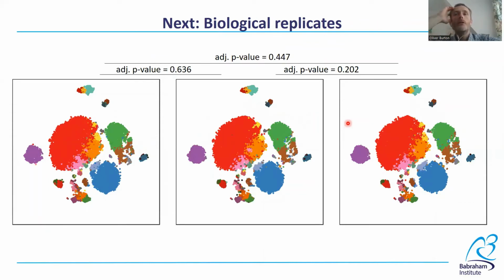In mouse research, we generally use inbred mice to eliminate variation. In this case, I'm showing you 3 t-SNE plots, 1, 2, 3, taken from 3 different mice. The cross entropy test shows them to be indistinguishable. So far, I've shown you a lot of examples that are pretty uninteresting, all negative results. Let's look at something else.